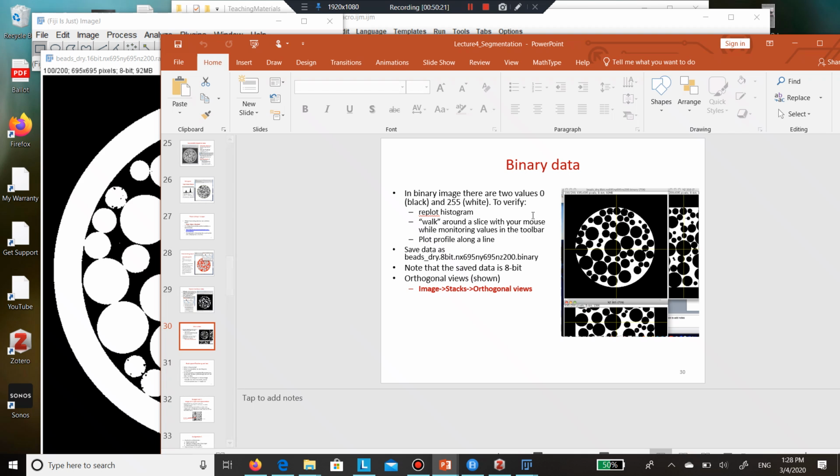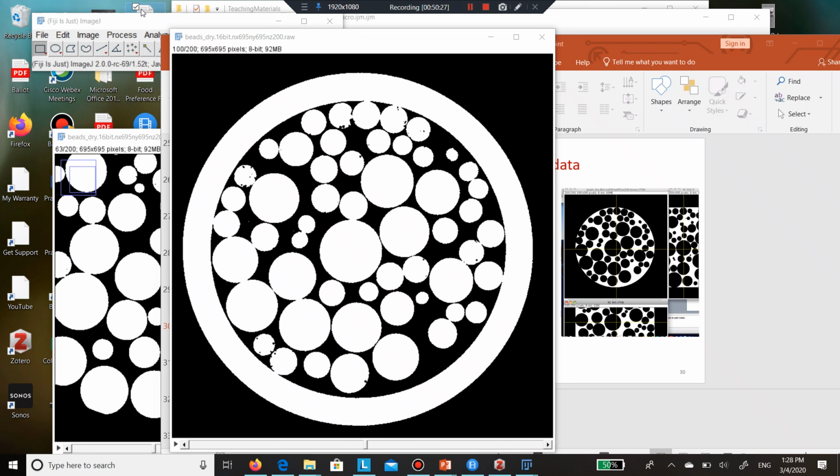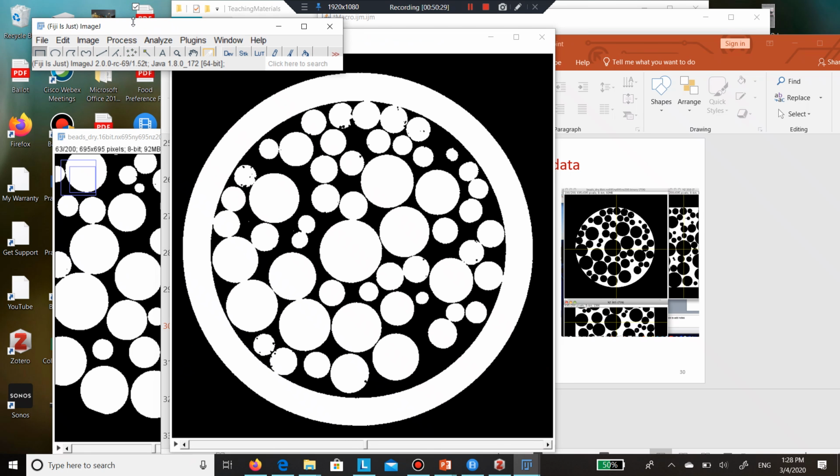Once you have binary data, ImageJ, and that's again a matter of choice, works with binary data. It shows it as black, 0, and white, 255. I'm used to working with 0 and 1, and a lot of segmented images come as 0 and 1. But 0 and 1, when you show them here, would show all as black. So don't be scared of that sometimes.